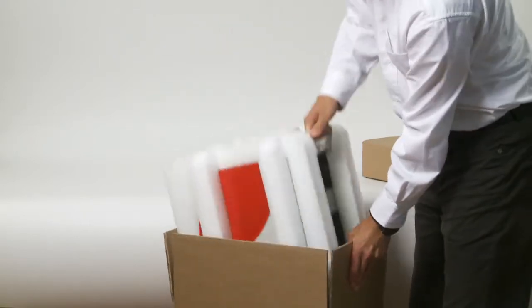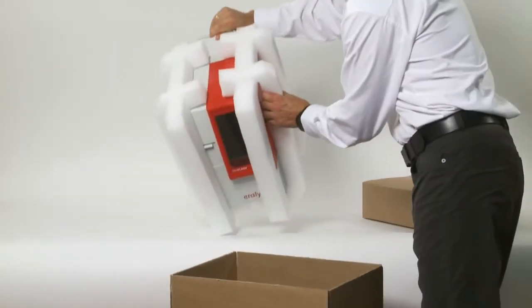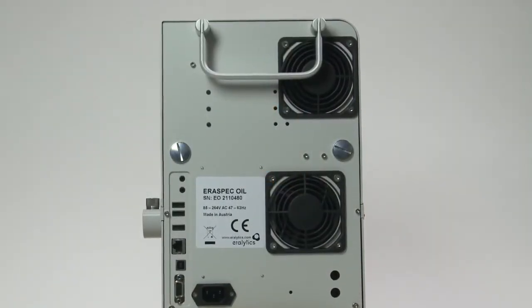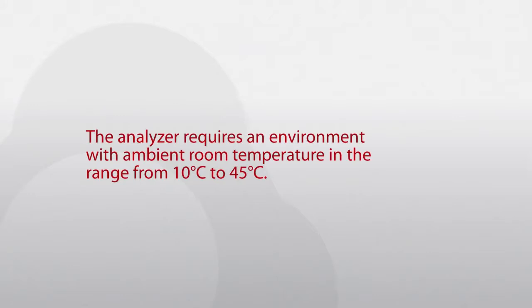After unpacking, place the instrument on a stable bench top. Make sure that the vent holes of the analyzer are not obstructed. The analyzer requires an environment with ambient room temperature in the range from 10 to 45 degrees Celsius.